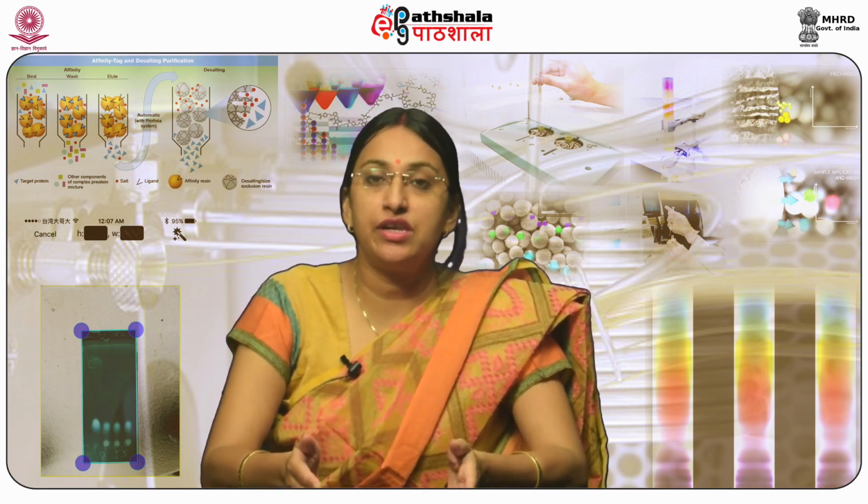Mixing of solvents in HPLC. The solvent delivery system must be capable of mixing solvents homogeneously and vary the polarity of mobile phase gradually. In an isocratic mode, the solvent composition is kept constant throughout the chromatographic run and the analytes elute out when a fixed volume of mobile phase has transited through the column.